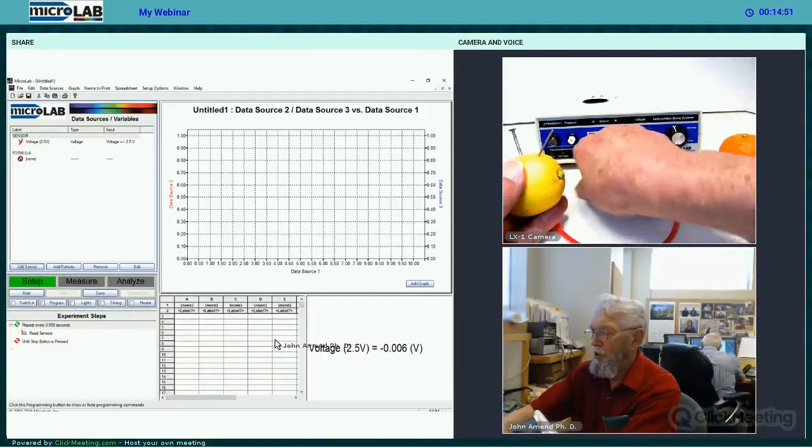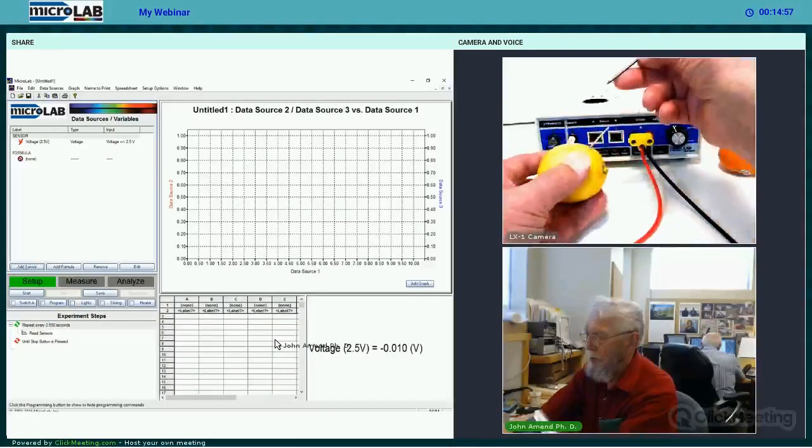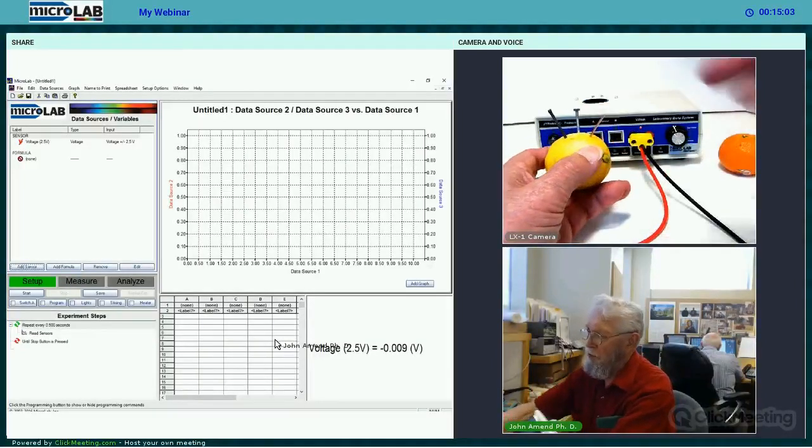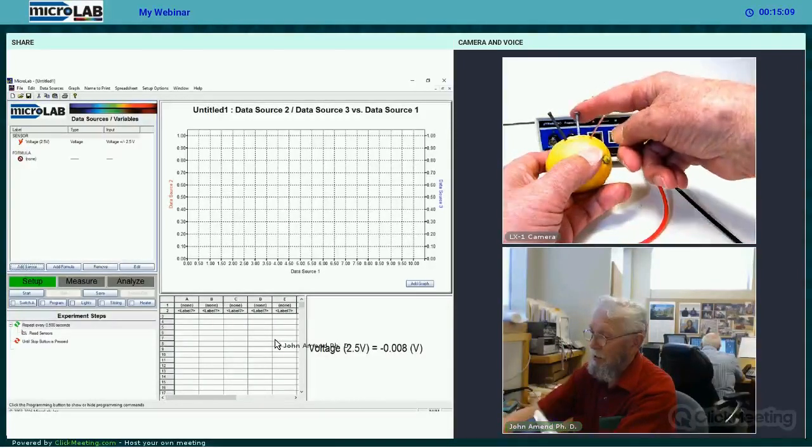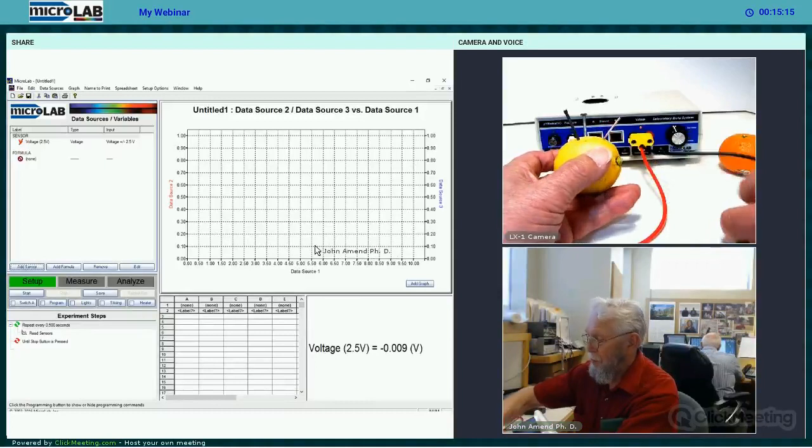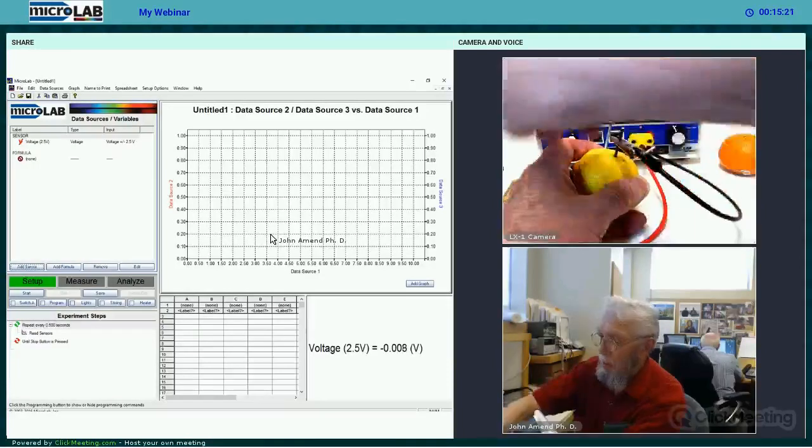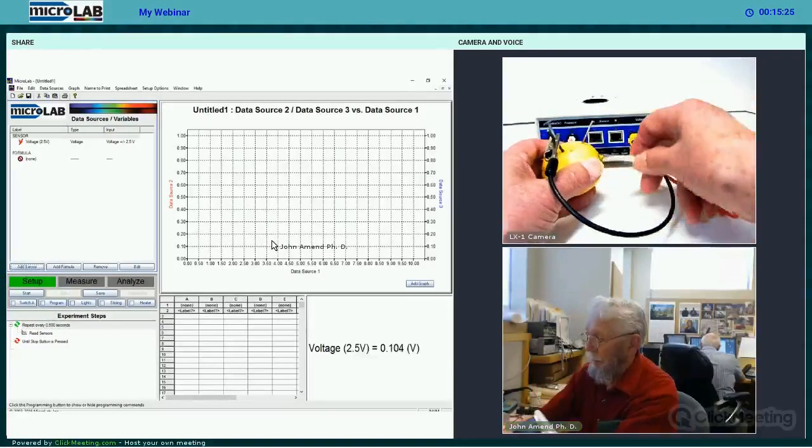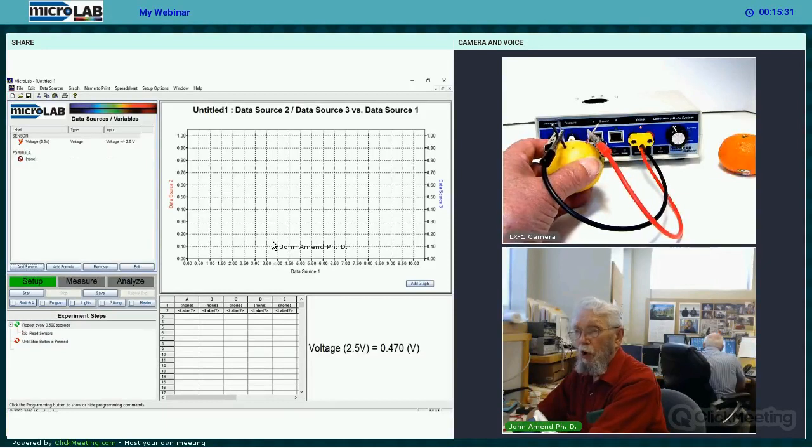Okay. We managed that for that particular system. But what if it was a different electrode than that? We had an iron nail here. Let's be very careful about it once again. And we have put an iron electrode. So we have really three electrodes in here. We only use two at a time. We used the zinc and the copper before. Let's try the iron nail and the copper nail.